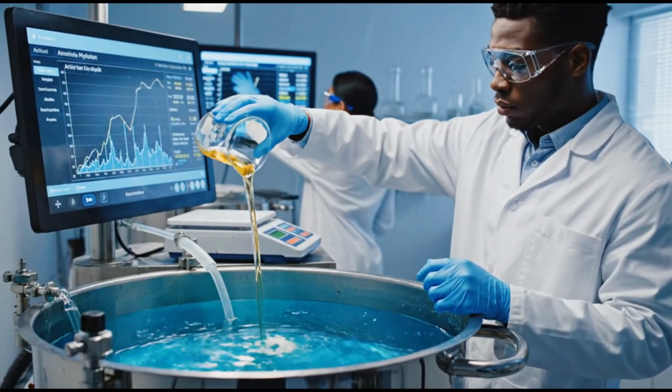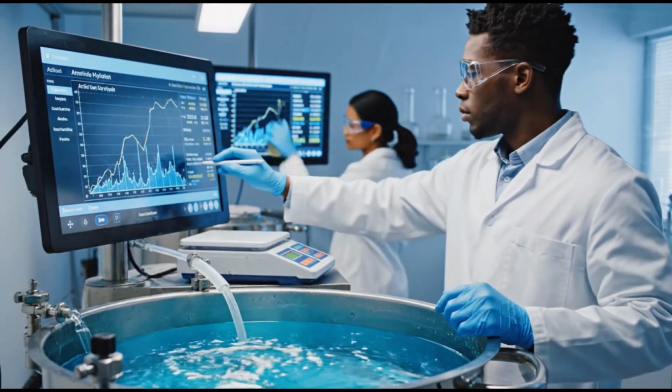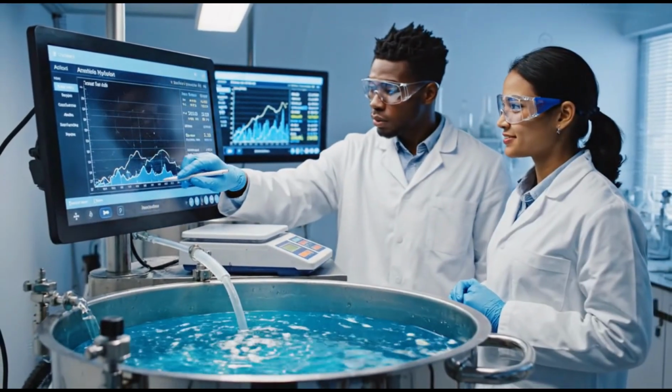Readings are stable. Proportions confirmed. Verified. We are good to proceed.